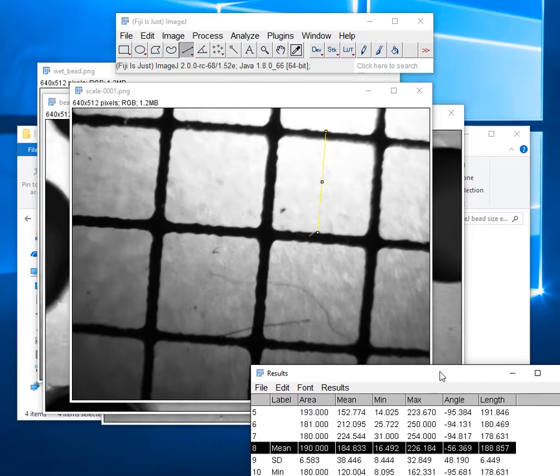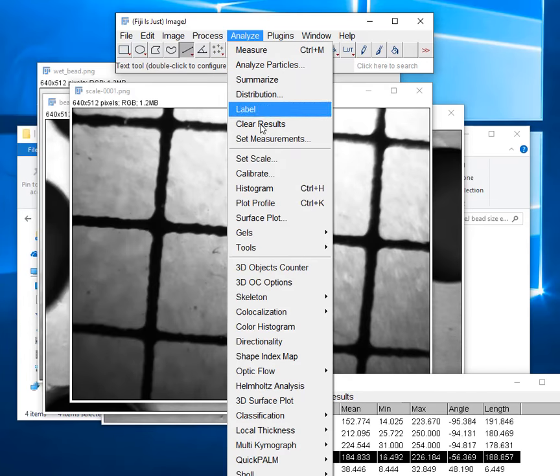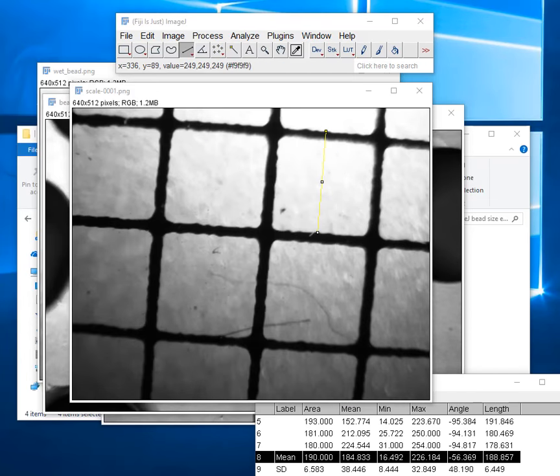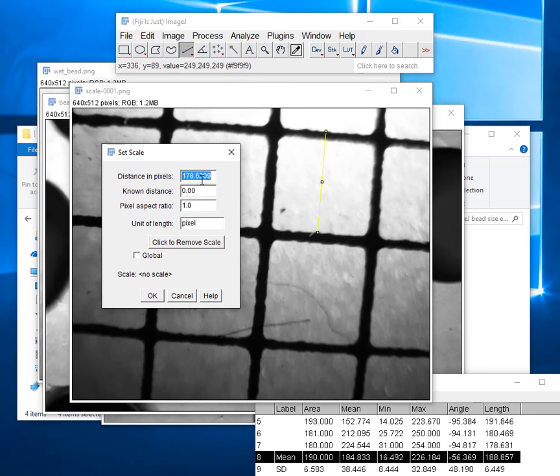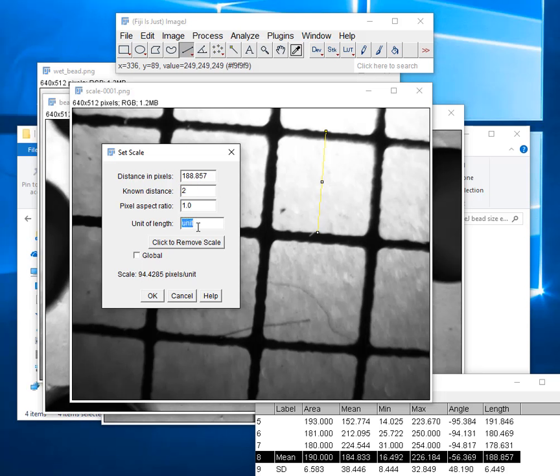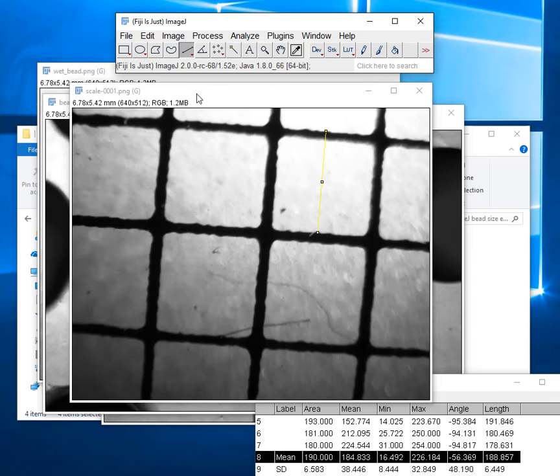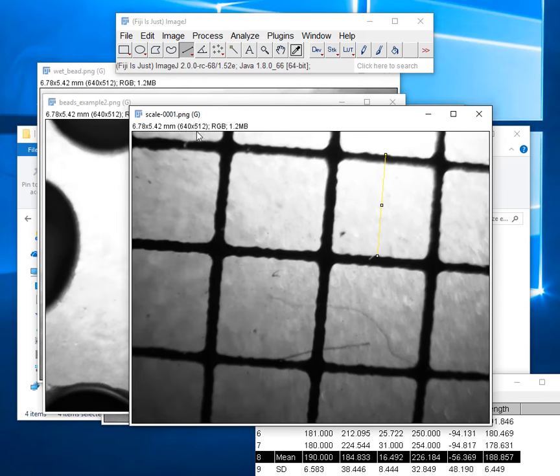Now we can use analyze set scale as I showed you before to set the measurement. And so it put in the last thing we measured but that's not what we want. We want to use the average here that we found. So I'm going to put in the distance in pixels is 188.857. The known distance is 2 and the unit is millimeters. Okay and it does the calculation, it says that means it's 94.4285 pixels per millimeter. Our pixel aspect ratio just means it's a square where it's the same in the horizontal vertical direction. I'm going to click global and that means it will apply to every image we have open. And so that's exactly what it did. So now it not only has the pixels but it also has the size in millimeters.